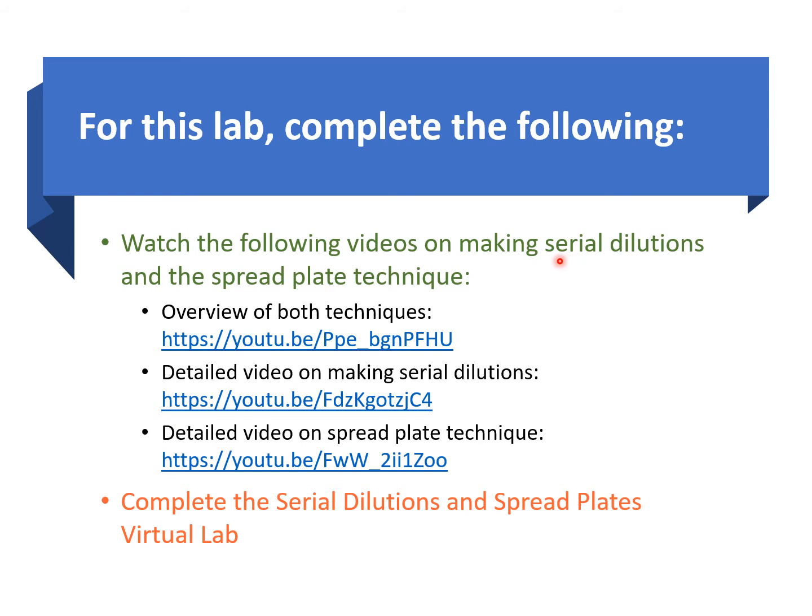And so there are a bunch of videos that help you see how we do it. And I highly recommend that you check it out. And then we also have the virtual lab for the serial dilution and for the spread plate that I also highly recommend that you check out.